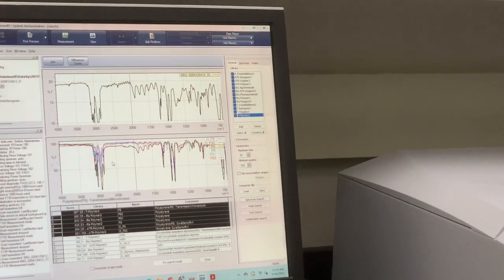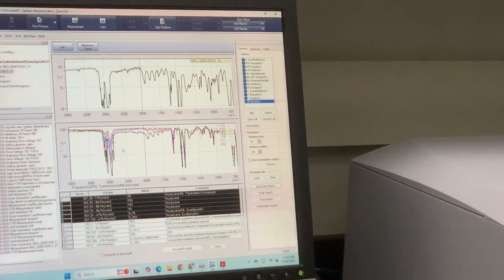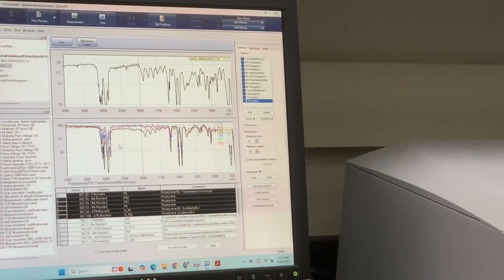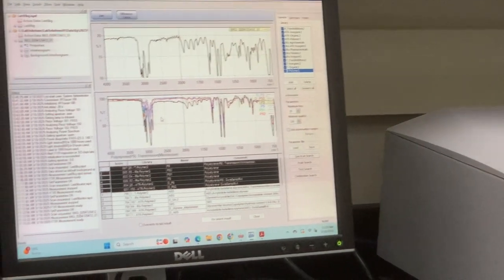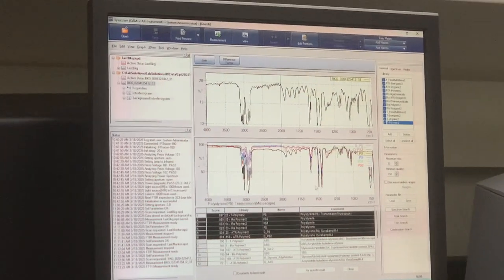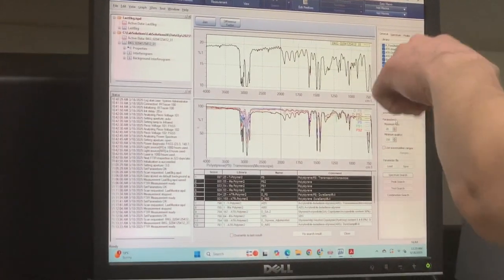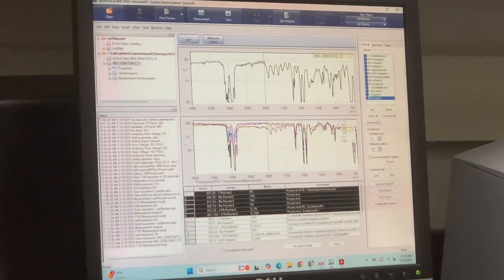Yeah, so if you have 3 layers on one, but then you are able to take measurements for each single layer. Yes, so I start with one layer, then add another layer, and add another layer again. That's a good strategy. But when I put the silicon wafer inside, actually it didn't work. It didn't give me silicon. You mean it didn't find it here? Like it didn't give you a match? It should be here because it's silicon.